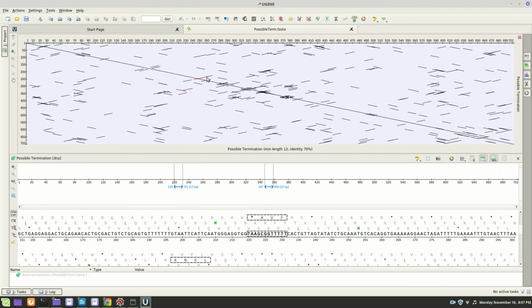It could be something like that one. There are lots of little pieces here, but you'd have to look. Don't go too far away from the center. And you need lines about this length, at least with this length of sequence here. But that could be a termination.